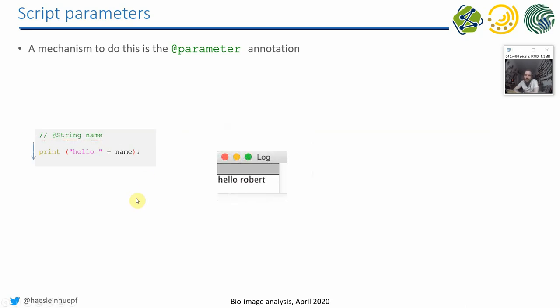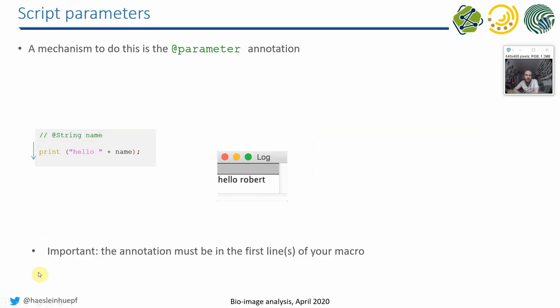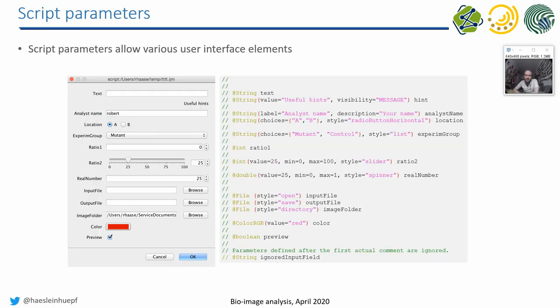And then, hello, Robert will be printed out. So this is how this particular syntax works. And you have... Yeah, it must be in the first lines of your macro, as I just said. And you have a lot of opportunities of how to tune this. So this is actually more flexible than the dialog I showed you earlier. But again, you can only execute it at the beginning of your program.